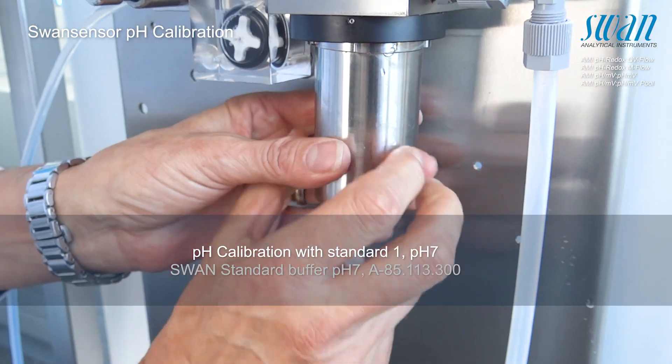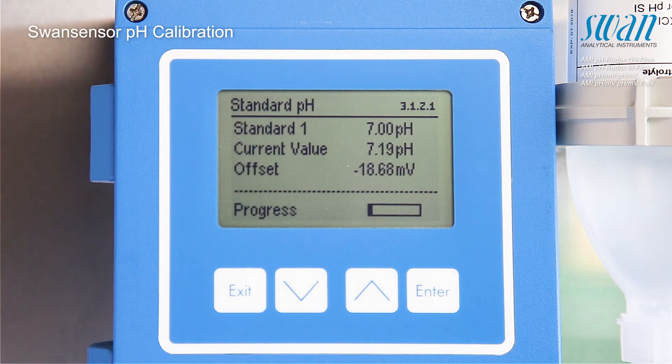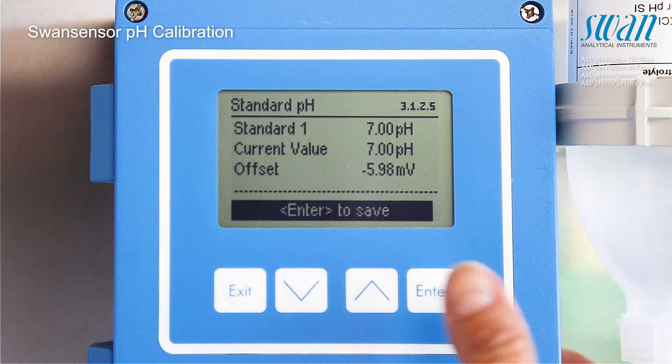Attach the calibration vessel onto the flow cell. Continue by pressing enter. Press enter to save the calibration with standard solution 1.